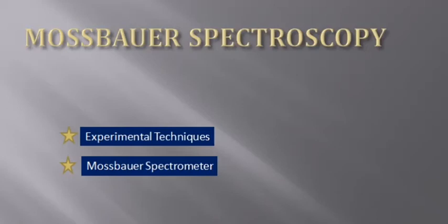Hello friends, in Mossbauer spectroscopy, my topic is the Mossbauer spectrometer. First I introduce you to some experimental techniques used in it.